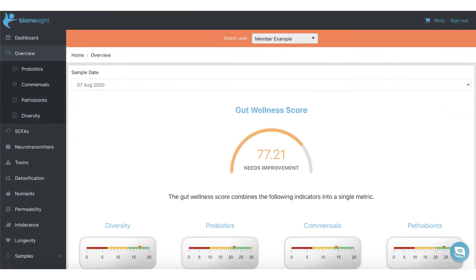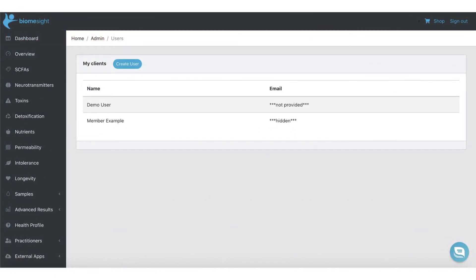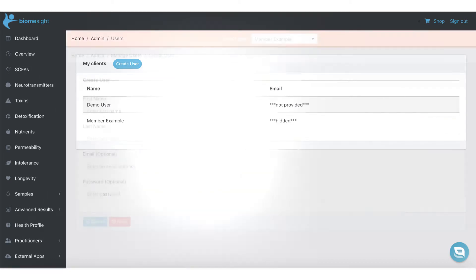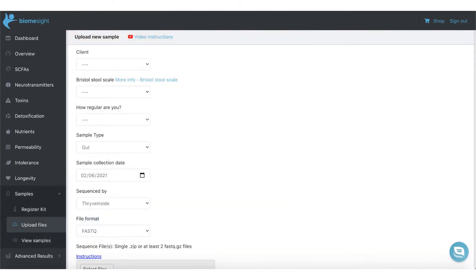From here you can access your client's health profiles, view your current list of clients, and create new clients. You can also upload FastQ sample files from other labs.